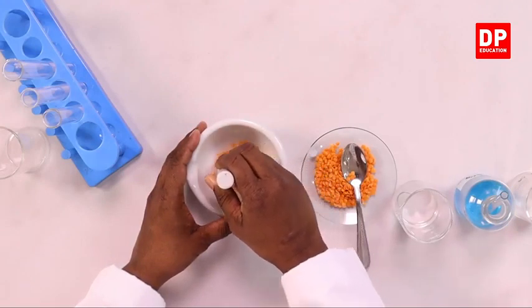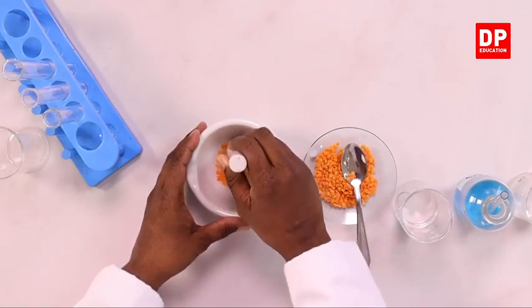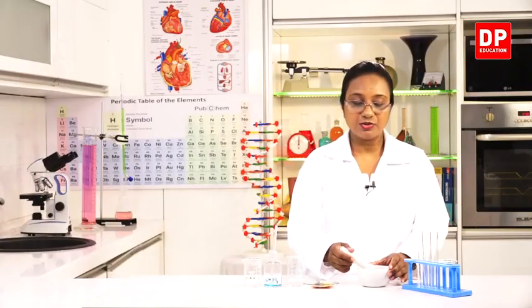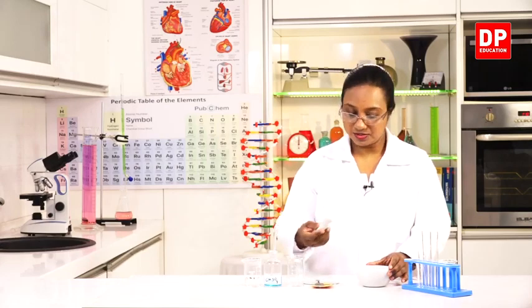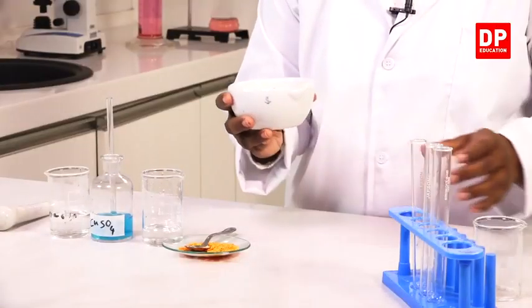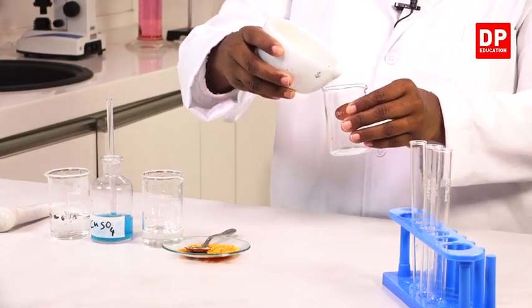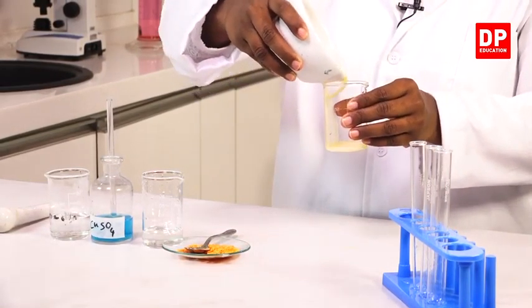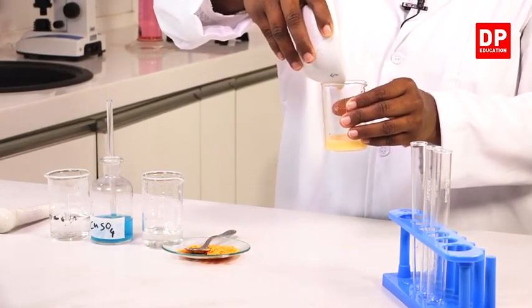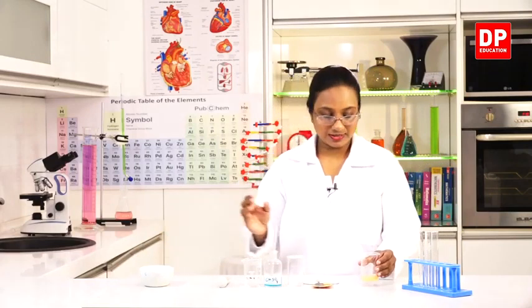You will have to keep on grinding it for quite some time so that the substance from the dal gets extracted into the solution. Now I have ground the dal into a nice solution and extracted the substance from it. I will decant this solution. Decant means just transfer the solution into a beaker. Now I will not be needing the mortar and pestle. I will put it aside.